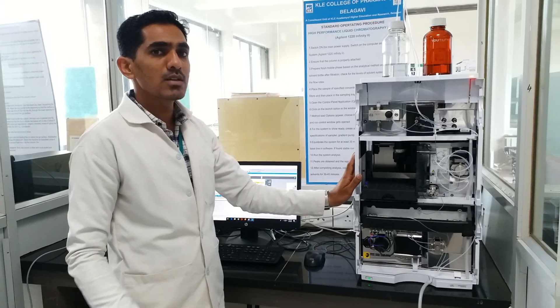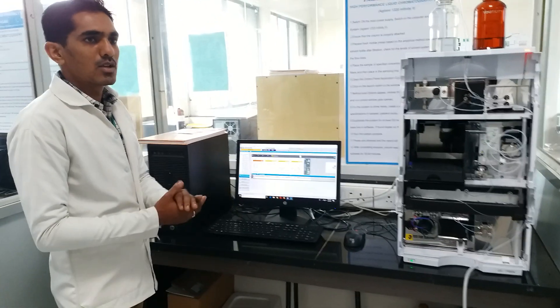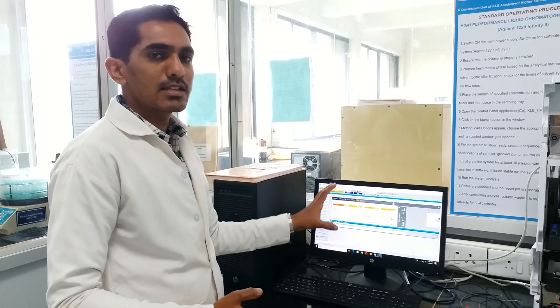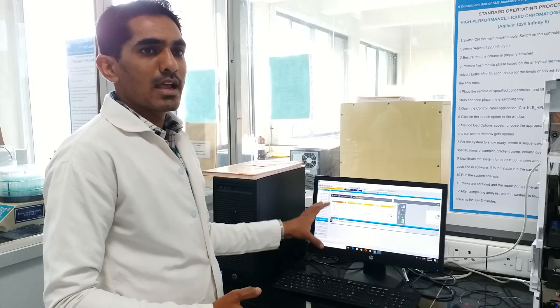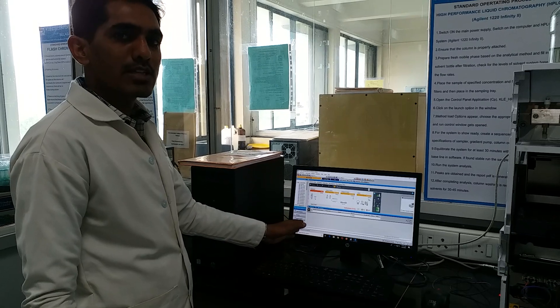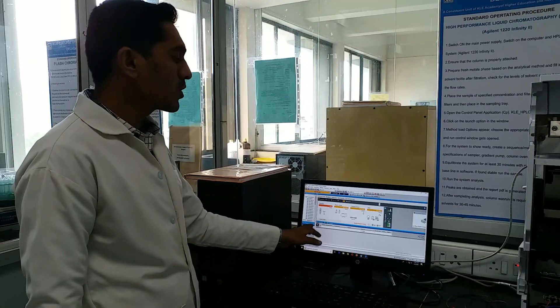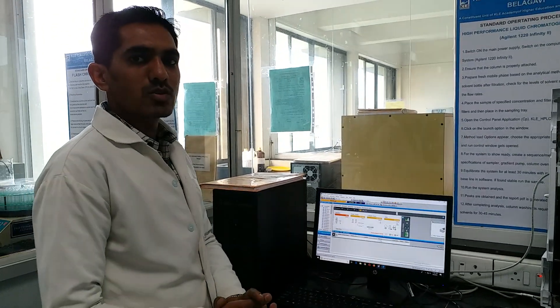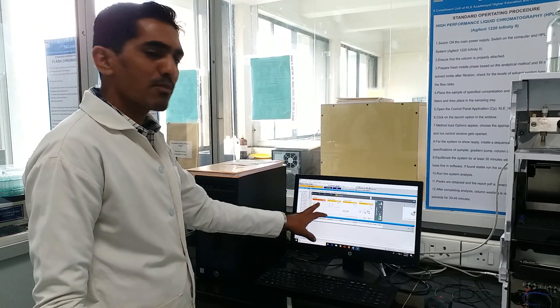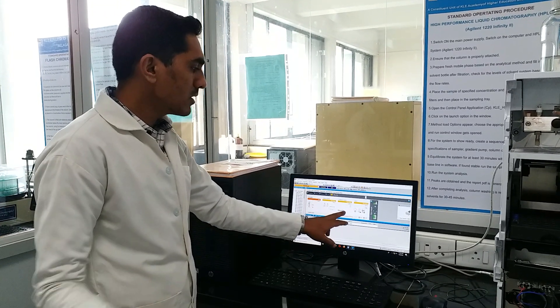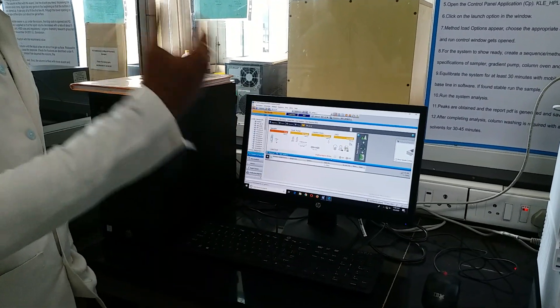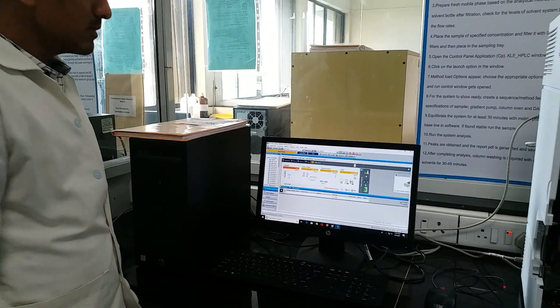Next we will move towards the software part. Here we have the ChemStation as software on our PC. It has different sections including method development, method validation, data analysis, data review, report layout, and data verification. The method and run control section is very important. Here it contains the sampler, the gradient pump, column oven, and the detector. The sampler controls how much amount of sample can be injected from the vial into the system.